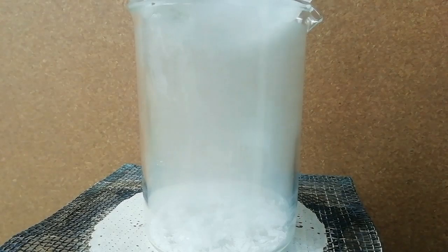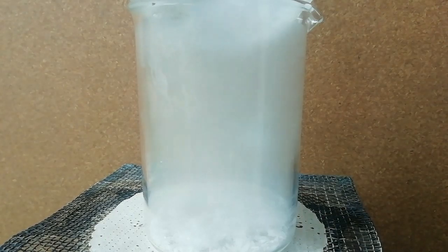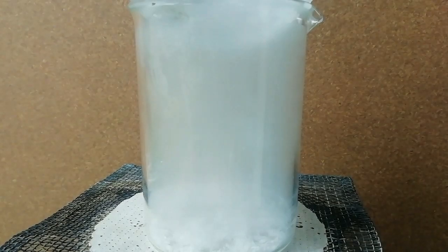Now I heat the beaker until acid begins to melt. After few minutes, you can see some thalic anhydride crystals are formed along the wall of beaker.